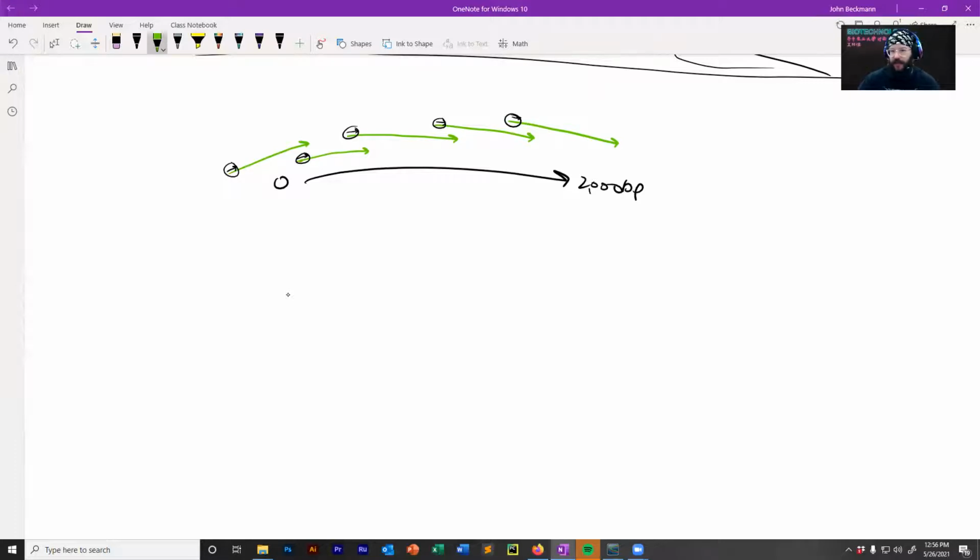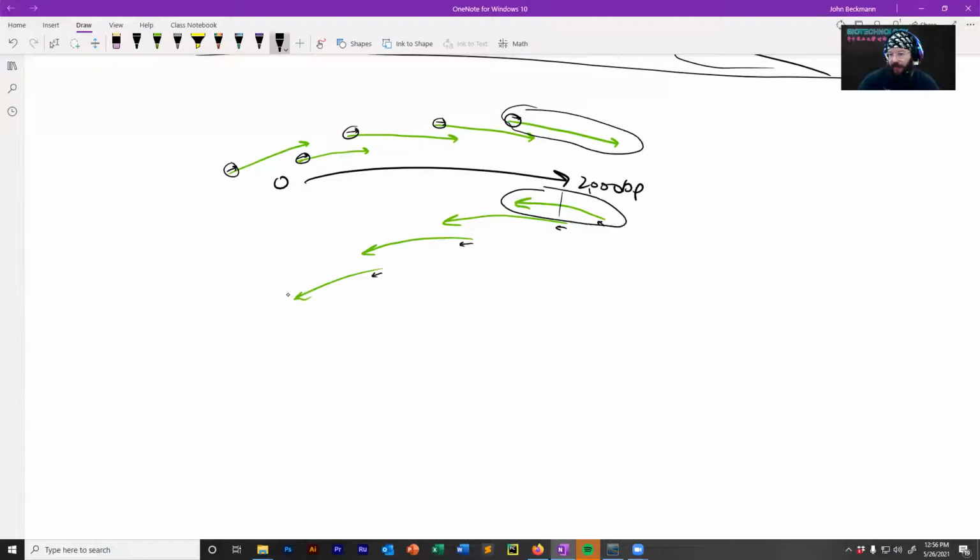So this same sequence could also be sequenced in the reverse by building primers that bind here in the reverse orientation. So Sanger can go either way because DNA is double-stranded, and this should match this in reverse complement. So you can get Sanger data from either a forward read or a reverse read, and sometimes you'll combine them both to build rigor into your data.